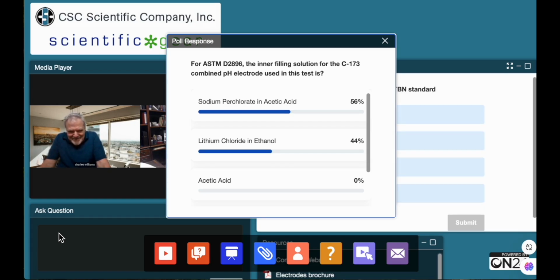How often do you run a TBN standard? Daily, weekly, before every sample run, or never? Give everybody about 30 seconds here.